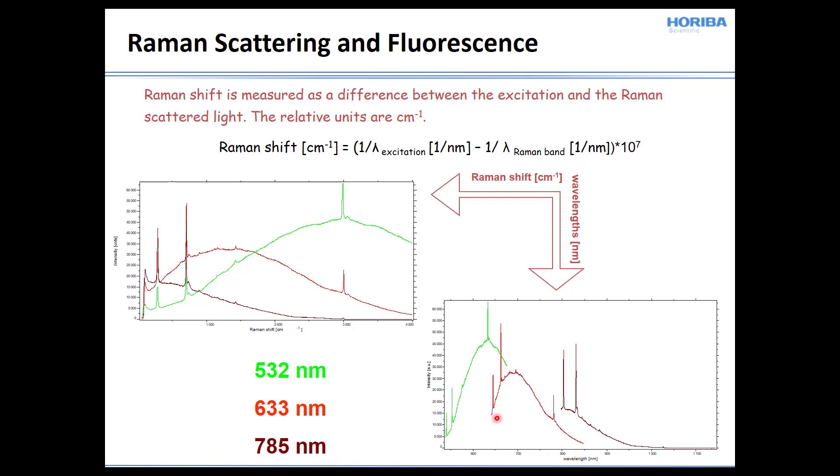So here are our Raman bands, which appear at different absolute wavelengths, which they should, because they're all shifted relative to the absolute wavelength of the laser light. And what we see is that laser excitation is being absorbed, and there is a subsequent emission. And so you see the fluorescence background extending through all of these three spectra. And so as you move to longer excitation wavelength, you're moving away from the excitation or absorption manifold and getting less and less fluorescence or emission in your Raman spectrum.